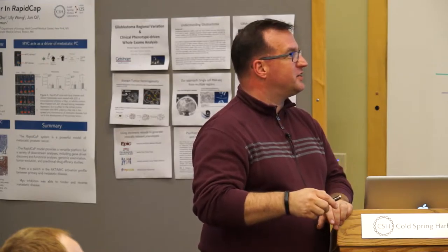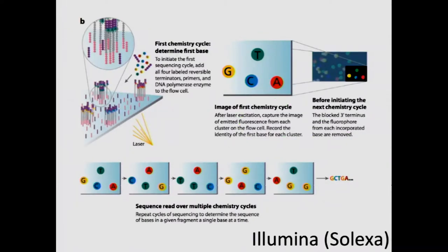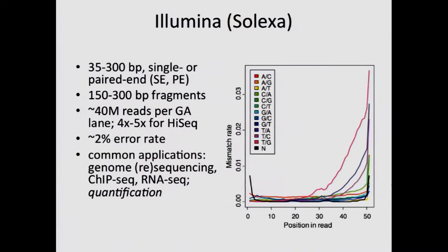Thank you. Yes. So there are certain kinds of mismatches, certain kinds of errors that Illumina will tend to make, and it's not homogeneous. As you can see, early in the read the error rate is very low, but then this one, which is the T to G transition, and again, I apologize, I can't remember. Maybe T is the right one and it makes G instead, or maybe vice versa. Maybe T is the error and G is what it's supposed to have been. The point is that they're not homogeneous. Some of that comes from the spectral emission overlap between the different colors. Some of it comes from issues of GC bias and the enzymatics. This lagging phase, out of phase effect is different for different kinds of sequences, depending on the GC composition.